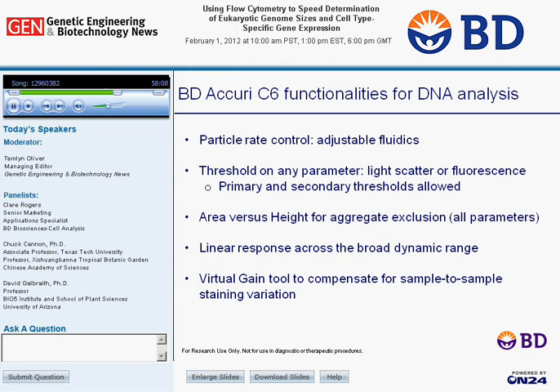So many people like to add, for instance, something, if they're doing a mammalian cell cycle analysis, they may add trout erythroid cells or nuclei to each sample, so it has a very different DNA content and will show up in a different portion of the plot. Those cells get stained along with the sample and then run on the flow cytometer. Typically people will adjust the voltage on the fluorescence detection parameter for the DNA stain, to place the internal standard in the same median channel value for each sample collected.